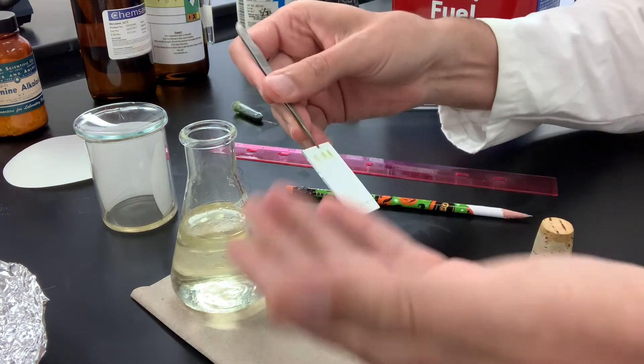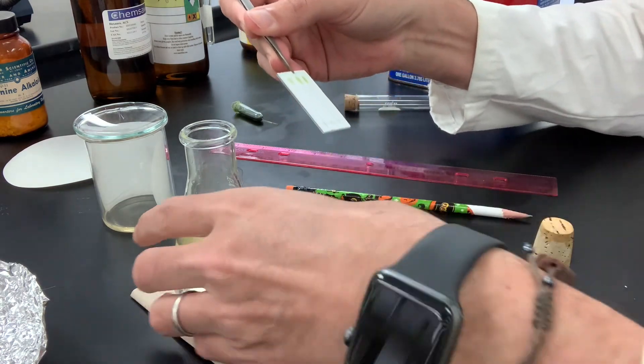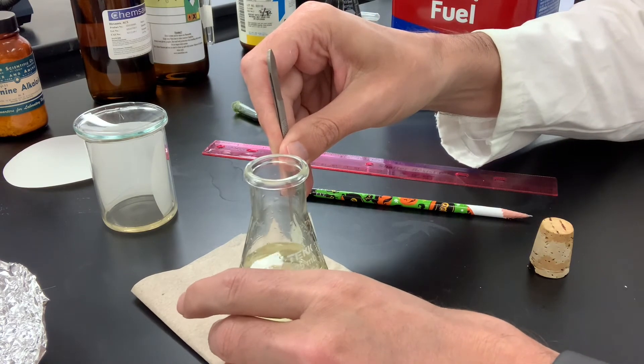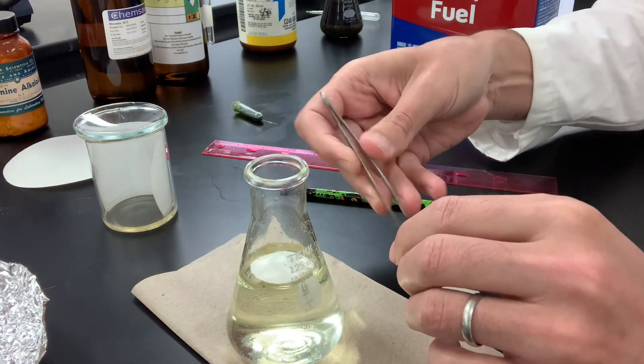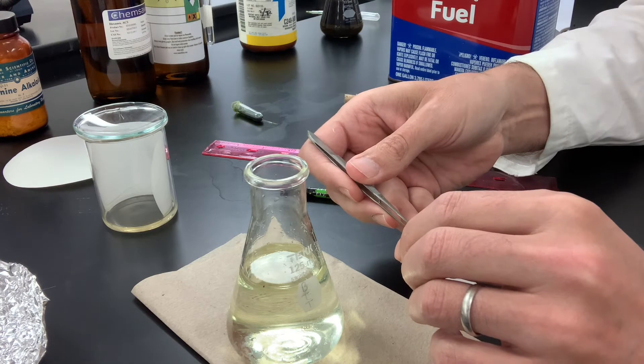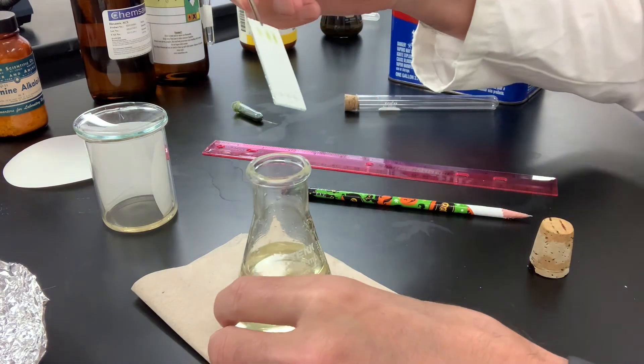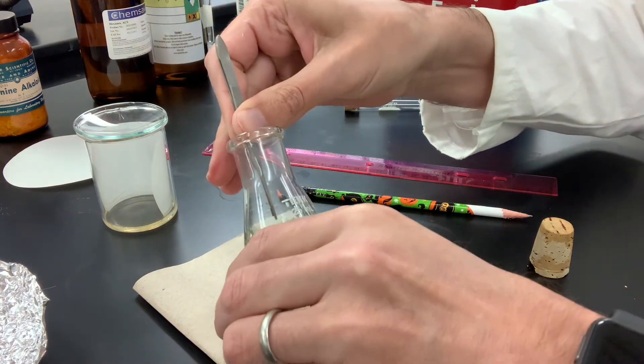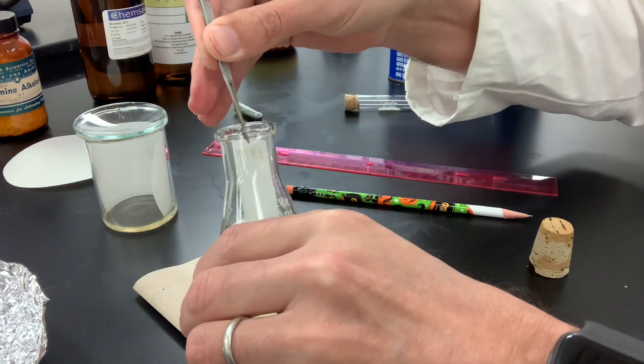Not everything's colored. These vinca alkaloids are colorless, so we want to dip this into the TLC developing solution to get those pink, purple, green, blue spots that were mentioned in the research paper. So we'll insert this in here. We'll pull this out.